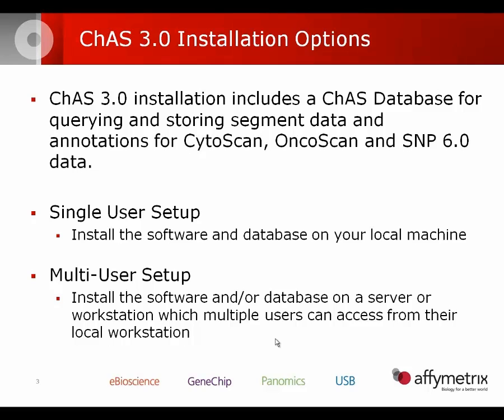The CHAS 3.0 installation now includes not only the browser but also the option of a database for querying and storing segment data, as well as annotations for those segments and sample level annotations. This is available for Cytoscan arrays, Oncascan, and SNP6 data. You have a couple of ways to set up the database: a single user setup where you install the software and database on your local machine, or a multi-user setup where the database is installed on a server or workstation on a domain accessible by multiple users.